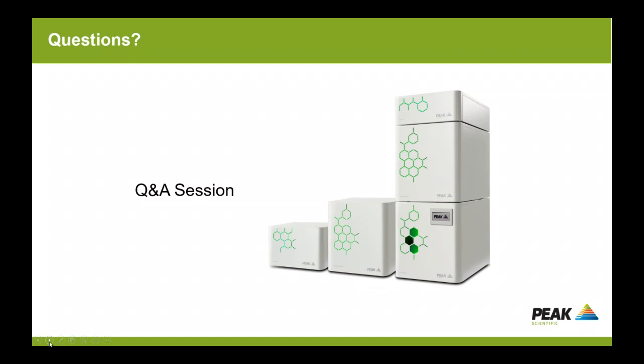Had a question on how long it would take to convert from helium to hydrogen carrier gas. So as I mentioned in the previous slides, this will depend on the method that you are looking to convert. And it will also depend on which detector you're using. Typically what we've found with customers is that for GCMS systems, it typically takes a little bit longer because it takes some time for the background within the system to stabilize if you're converting from helium to hydrogen. If you are investing in a new GCMS, it should be a little bit faster because you don't have any of the background that can result from having used helium.